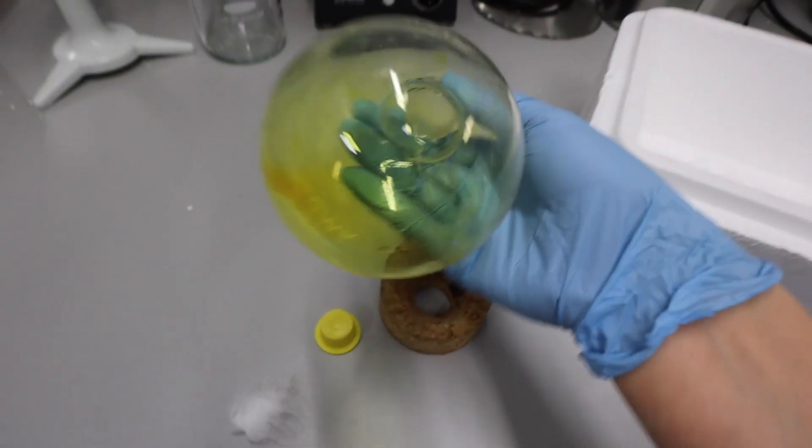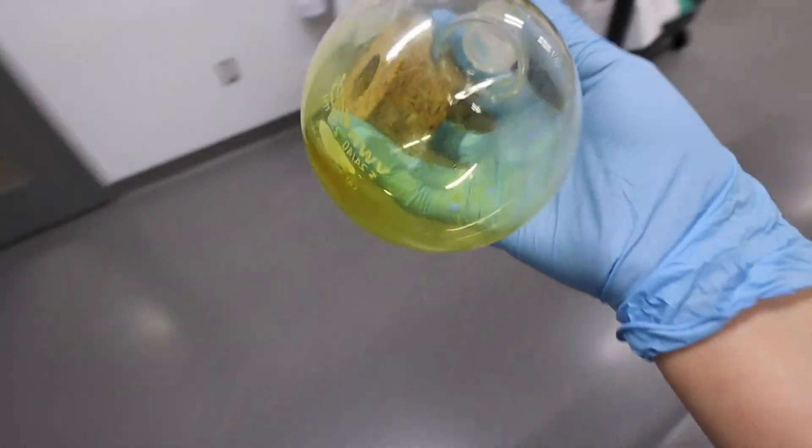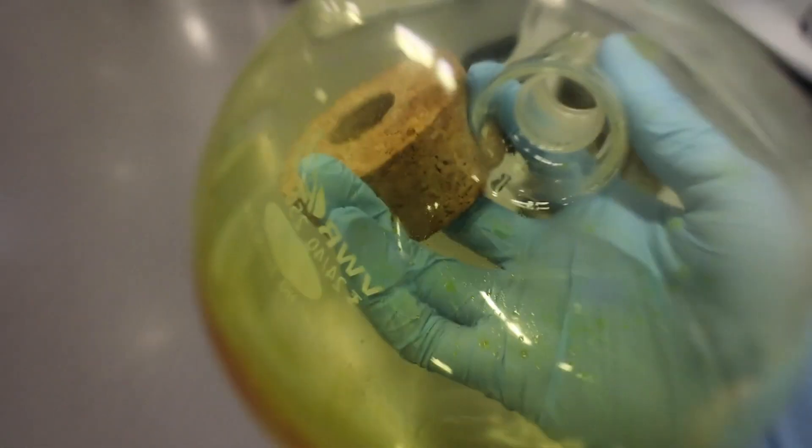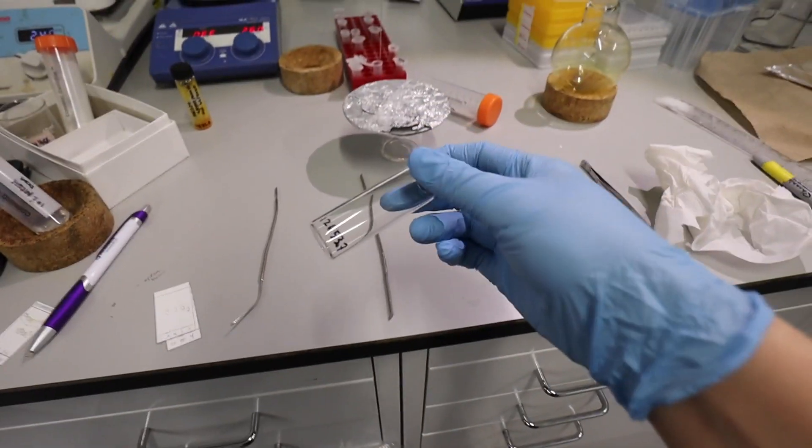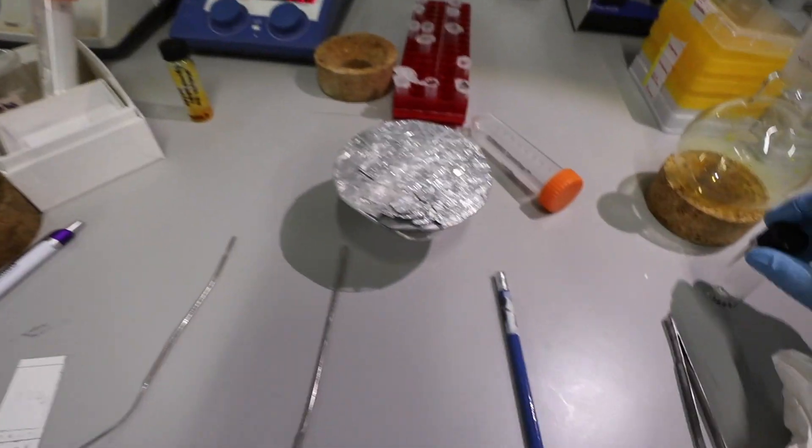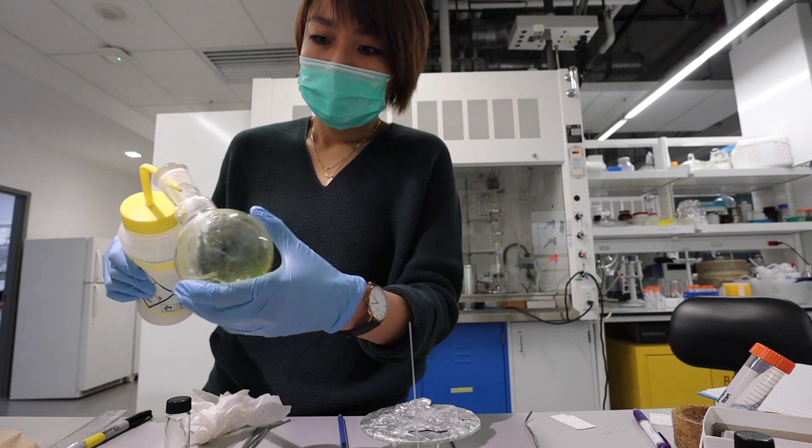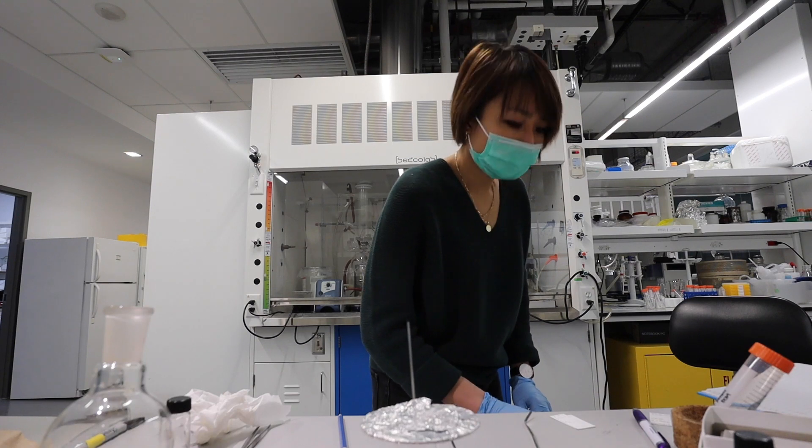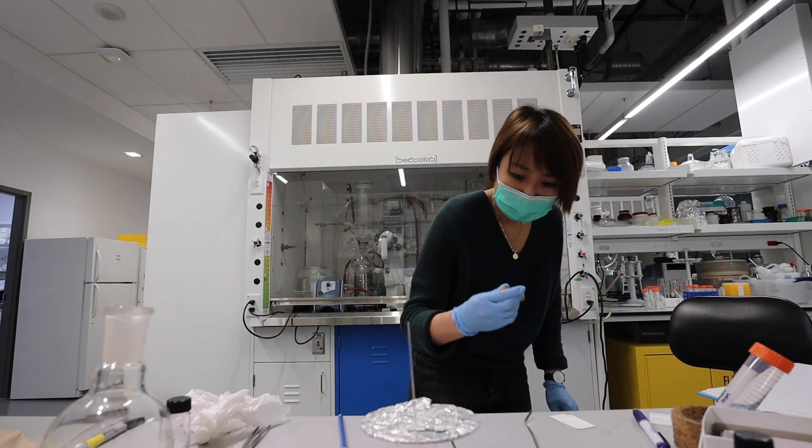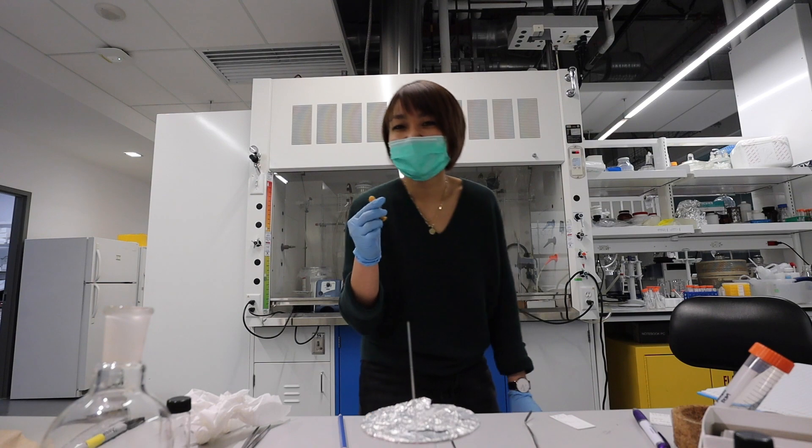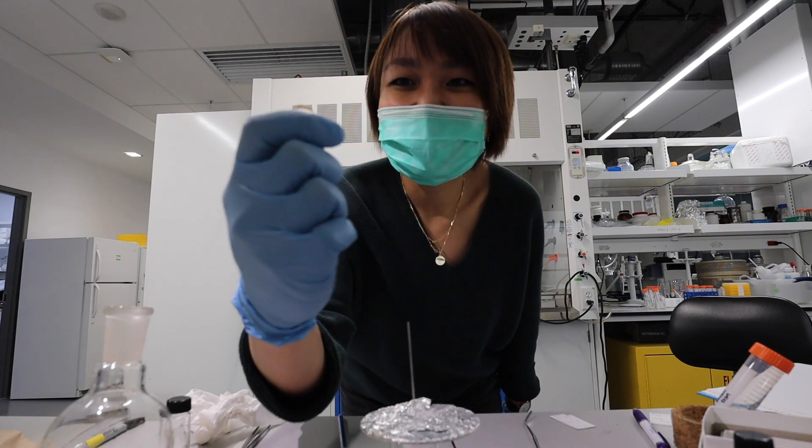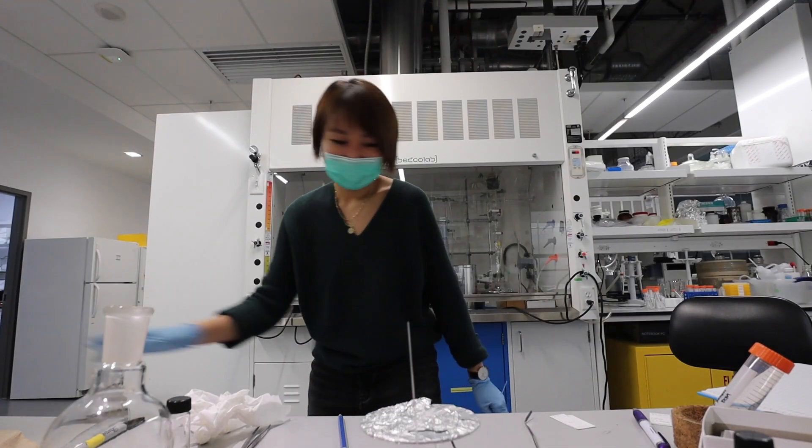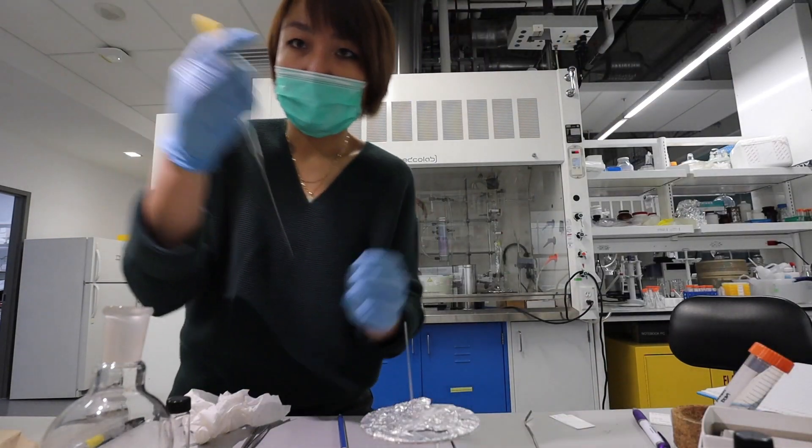All of that work for this much. Oh my gosh, I'm going to dilute this in DCM and then I transfer it to a smaller vial. So I have my vial here with the tare weight. Oh so close, so close. It's so old, it's crispy now. Oh my gosh. Okay, found one.